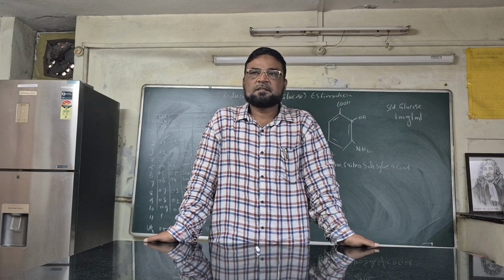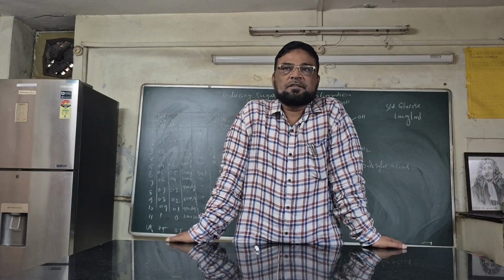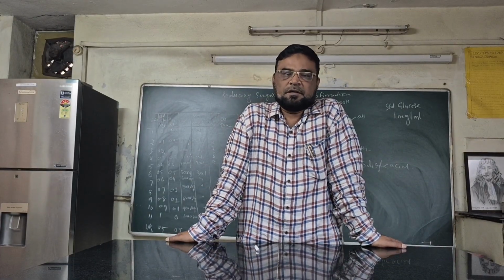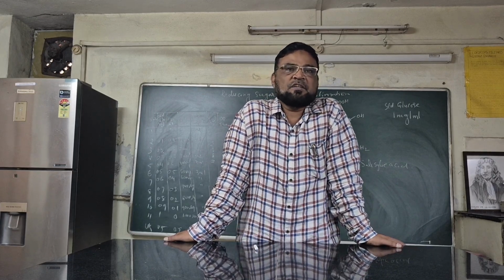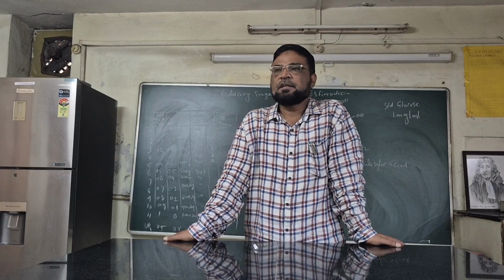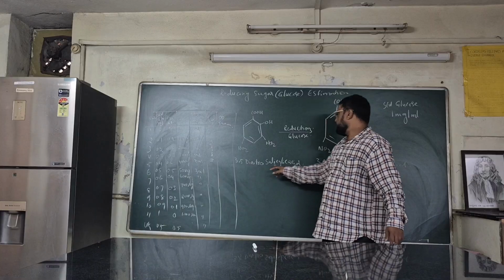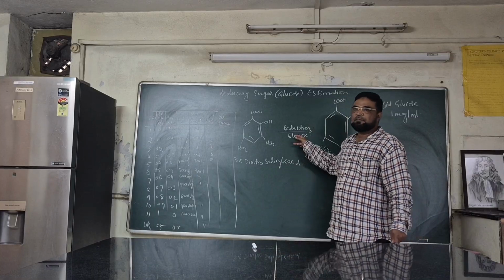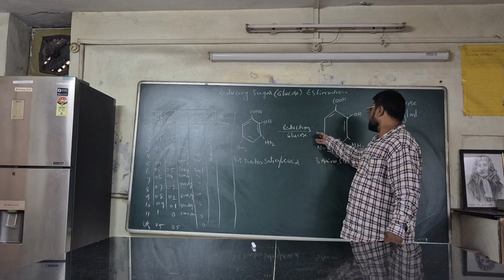Here the principle is concerned: glucose is a good reducing agent. That's why it is called a reducing sugar. So here, the DNS reagent is reduced. DNS is nothing but 3,5-dinitrosalicylic acid. In the presence of a good reducing agent, glucose, reduction takes place.